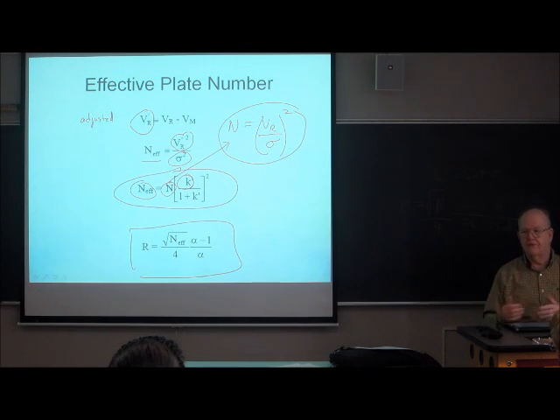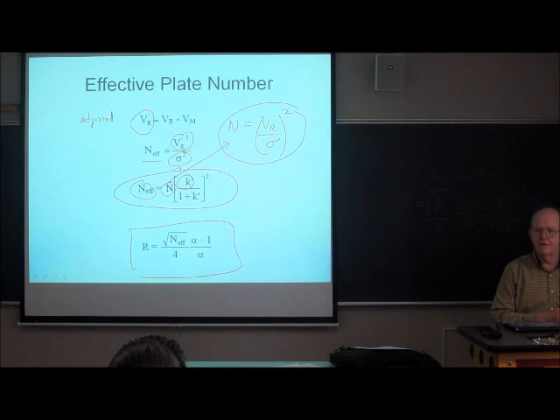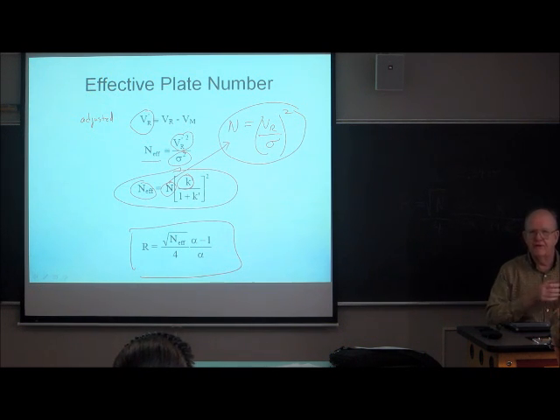In fact, this is a serious issue. In a little while, we're going to be talking about open tubular capillary gas chromatography. What preceded it experimentally was packed bed gas chromatography. How can you validly compare these two technologies when the retention factors in open tubular capillary GC are a lot smaller than the retention factors in packed beds in general?